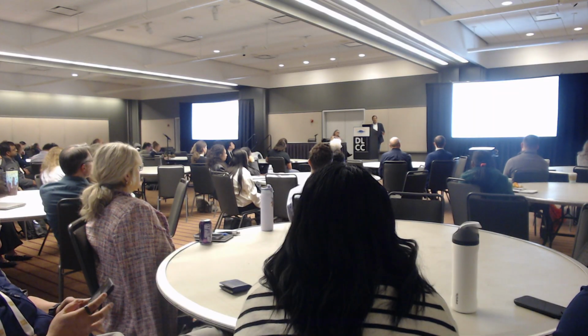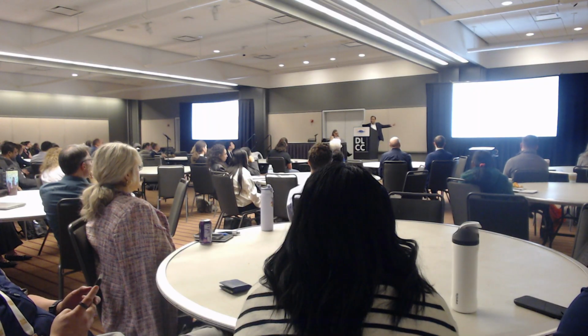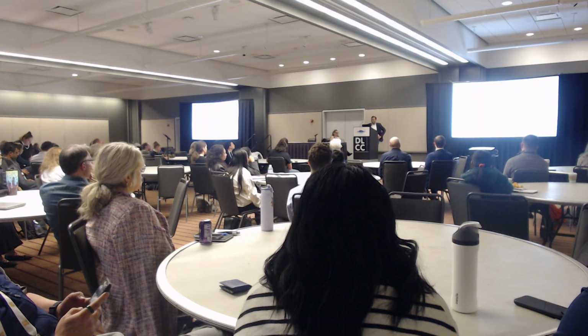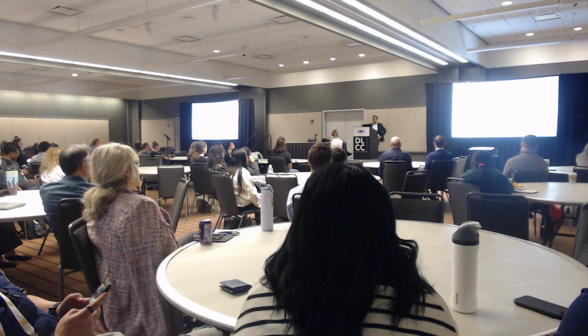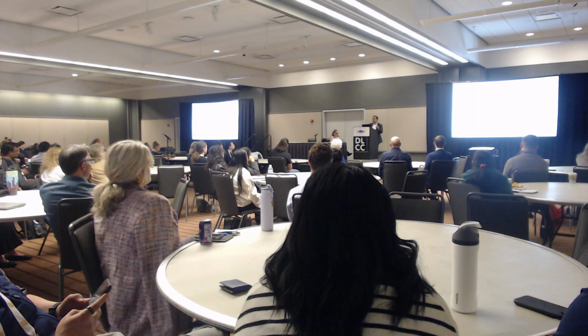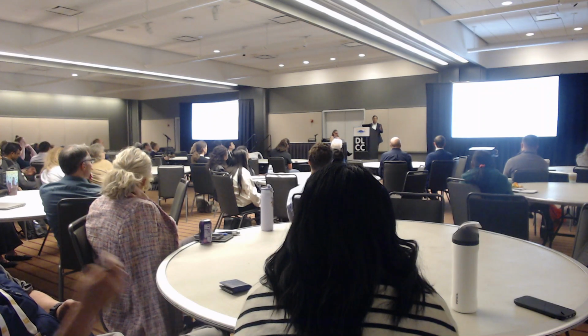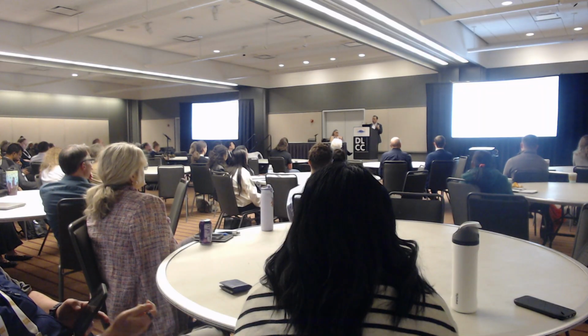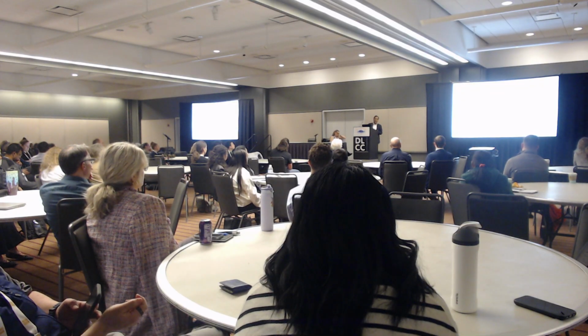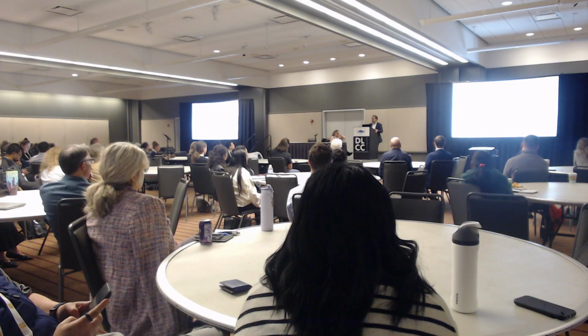Next I'm going to talk about HiChIP, which is actually the beast around here. This is an image from Dr. Bing Ren's group, and I have nothing against kits, but I'll tell you one thing why we deviated from the kit to do this experiment. It's very expensive. We're talking about $800 per sample just for the reagents when they arrive at the core, and now you add the core facility charges, labor cost, wastage, instrument use, and all that. So an investigator will end up paying almost $1,500 to $2,000 just to run one sample for HiChIP.